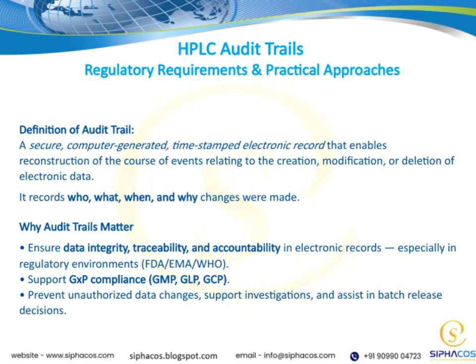Now, why do audit trails matter so much? Well, they help ensure data integrity, traceability, and accountability within our electronic records, especially in regulated environments like those overseen by the FDA, EMA, or WHO. They are critical for supporting compliance with GXP standards, including GMP, GLP, and GCP. Audit trails also play a key role in preventing unauthorized data changes, supporting investigations when discrepancies arise, and aiding in batch release decisions. They're not just about meeting regulatory requirements, they're about maintaining trust and confidence in our data.